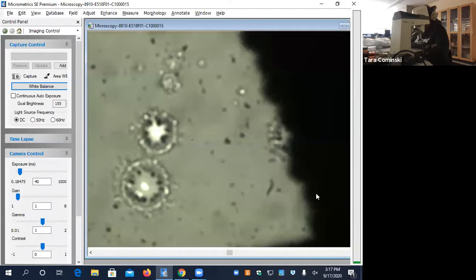Right. So, just take a little piece of onion. Where's your slide? Okay, here. Little piece of onion. All right, and then you have iodine there, Erica, that's fine to use, and you have methylene blue. So you're just going to take this dropper, take some of that methylene blue, drop it on there, a couple drops, and then you're going to put one of these cover slips on top, okay?